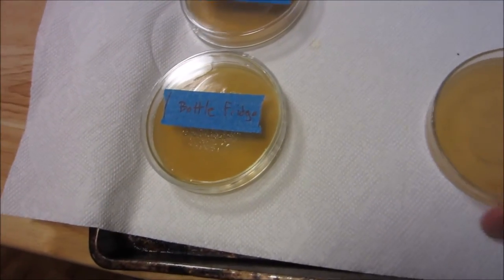Finally, we have the baby's mouth, which is packed full of microbes, as you can see here in this culture.